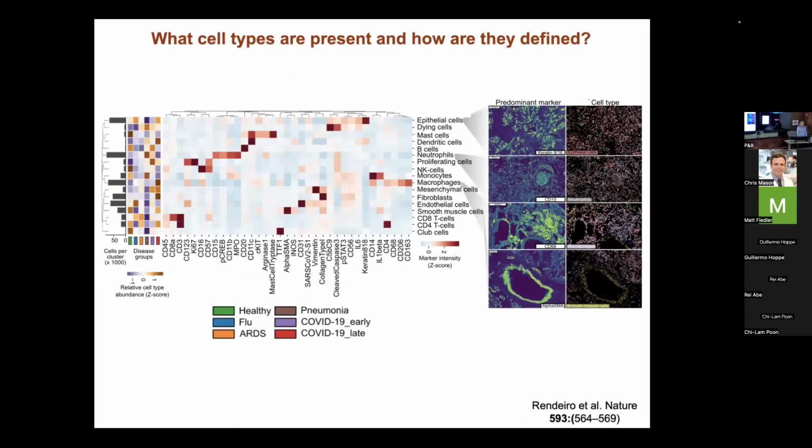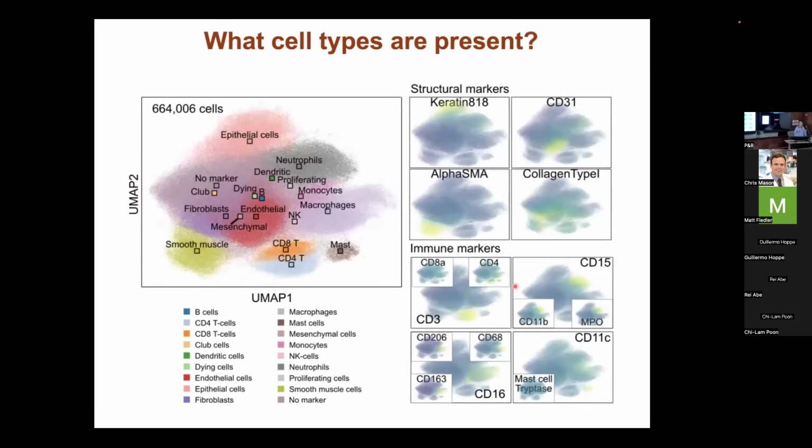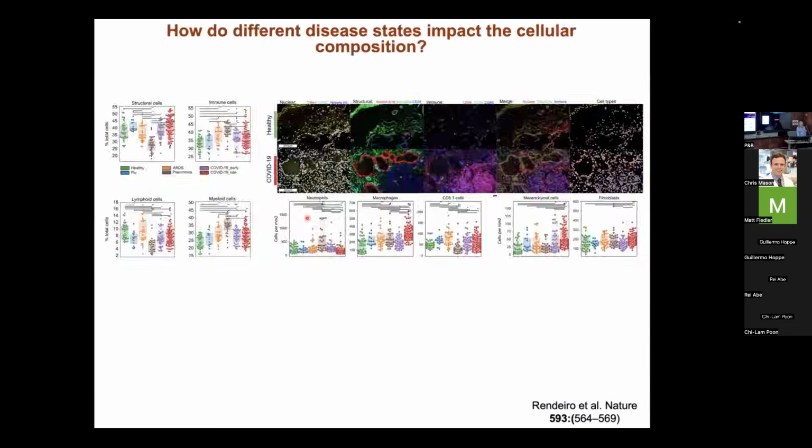And just giving you here on the right, I should have shown more pictures, but this also kind of gives you an idea of what these images might look like. But essentially, similar to what I described before, where the cells are, what the boundaries are, what proteins might be there. And this allows you to do cell clustering analysis similar to before.